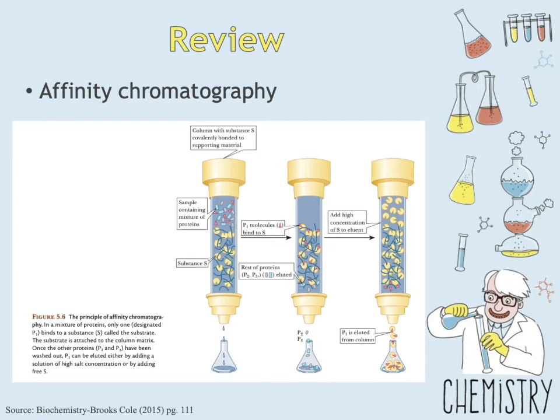Next, our knowledge doesn't limit only to what we have learned in the first type of chromatography. We also learned that affinity chromatography is a type of liquid chromatography for the separation, purification, or specific analysis of sample components. It also utilizes the reversible biological interaction or molecular recognition called affinity, which refers to the attracting force exerted in different degrees between atoms which cause them to remain in combination. For example, as you can see on your screen, there are three columns present.